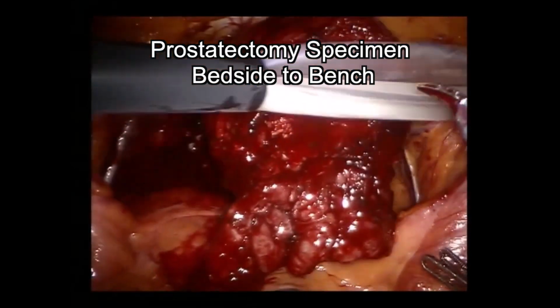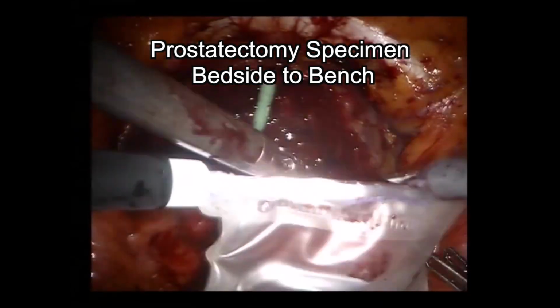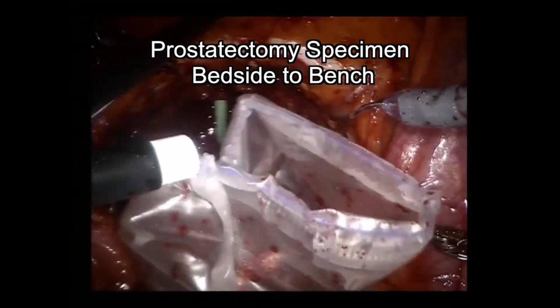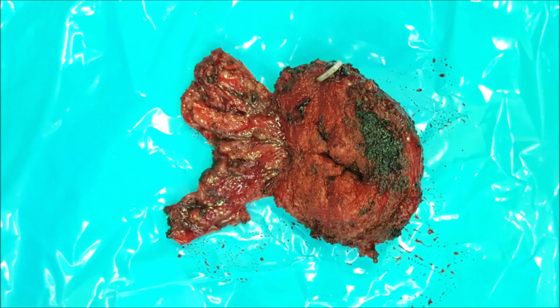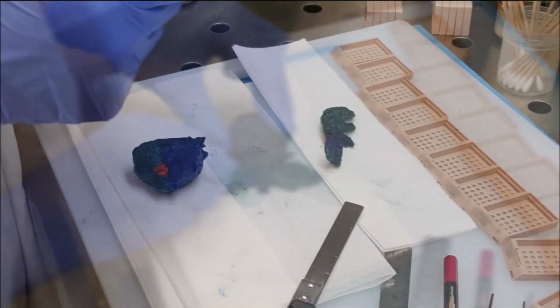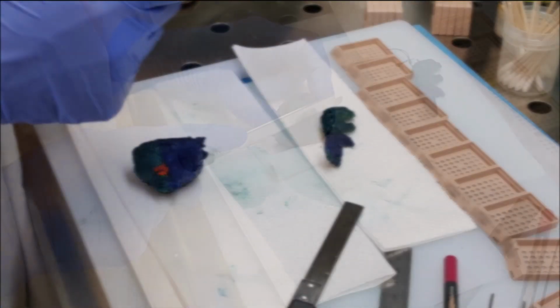Starting with the preparation of the prostatectomy specimen, its journey begins following a robot-assisted radical prostatectomy. The resected specimen is first fixed in neutral buffered formalin overnight to preserve its histological architecture. Following inking to preserve orientation of the specimen, the seminal vesicles are removed and the sectioning of the specimen commences.